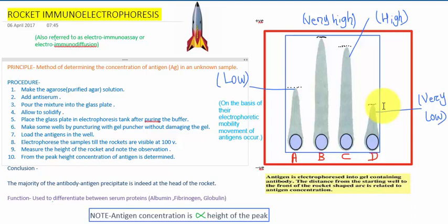Then place the glass plate into the electrophoresis tank. Before that, you need to pour the buffer solution into the electrophoresis tank. Then you need to make some wells in the glass plate by puncturing with gel puncture without damaging it. Then load the antigen and electrophorese the samples till the rockets are visible at 100V.